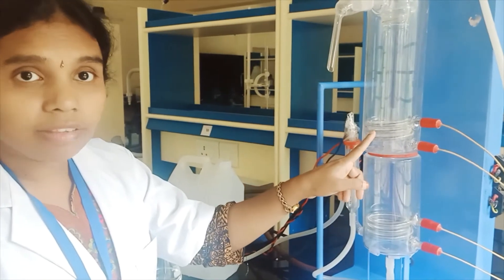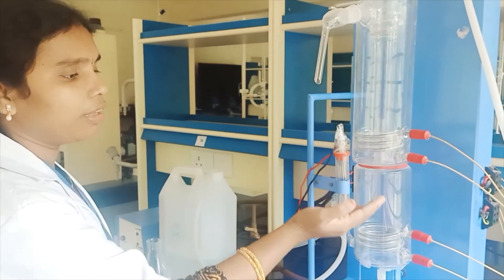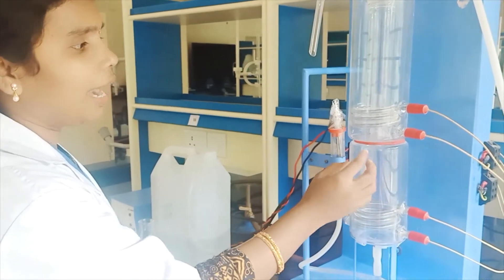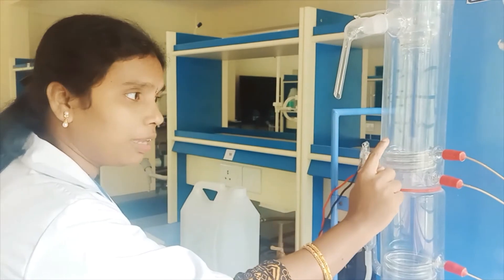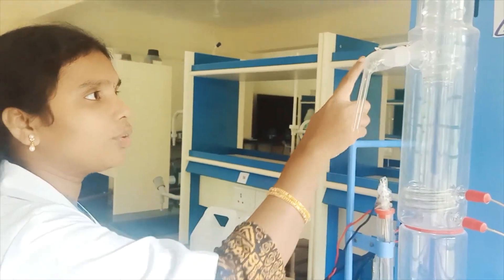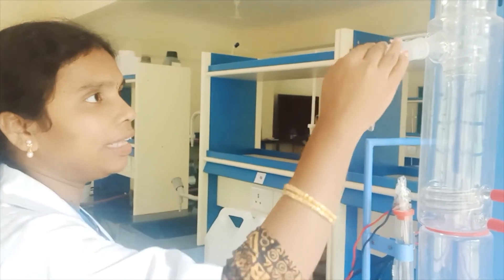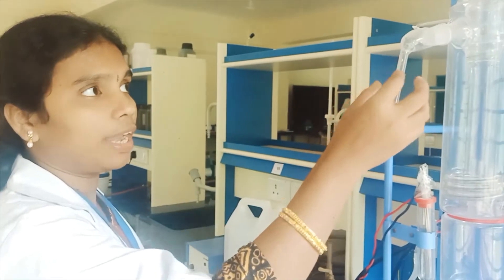There is a heating circuit, and because of the heat, the water will evaporate. The first layer will be collected in the inside jacket. From there, the water evaporates again and is collected through the second jacket, where it is condensed and collected from the collector tube.